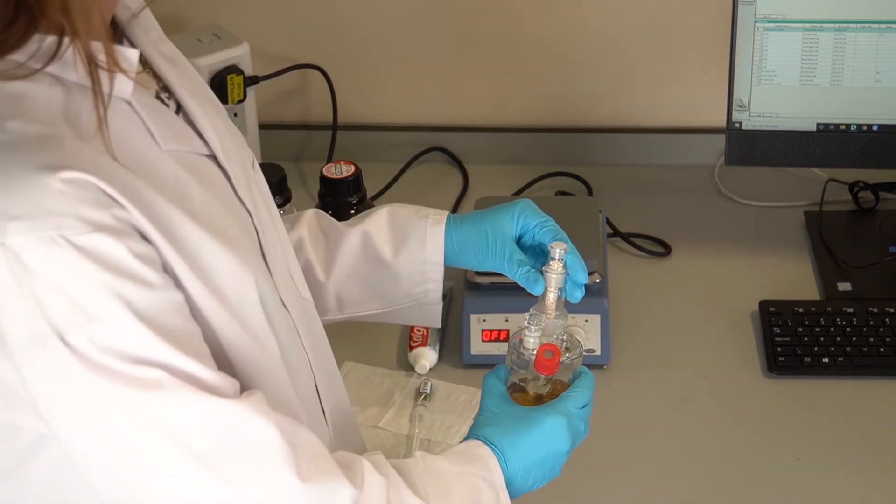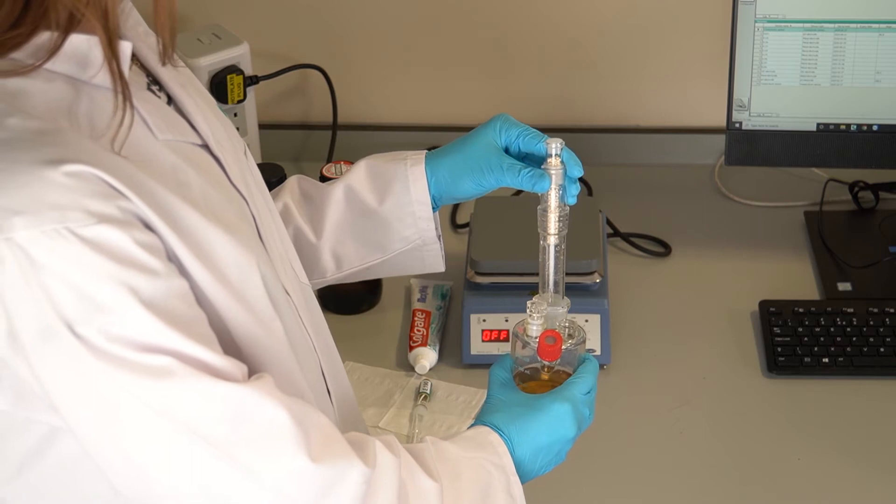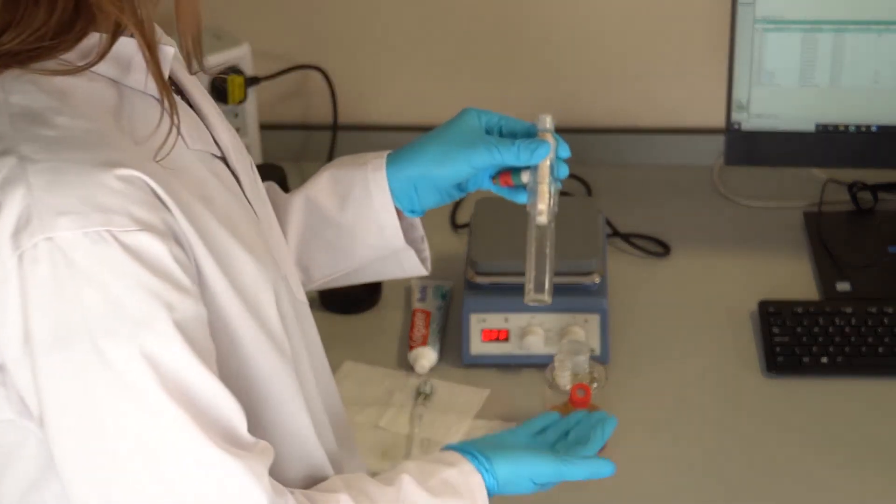Inspect the generator electrode for signs of damage. Particularly look for cracks in the glass or broken connections at the diaphragm.